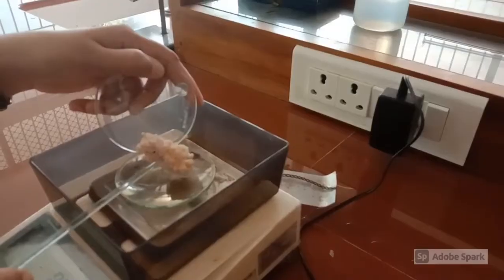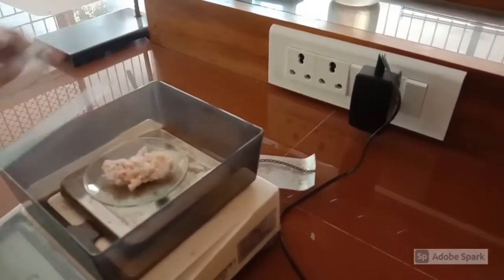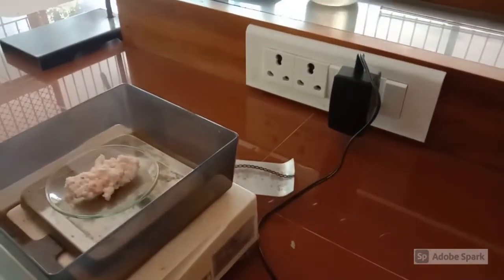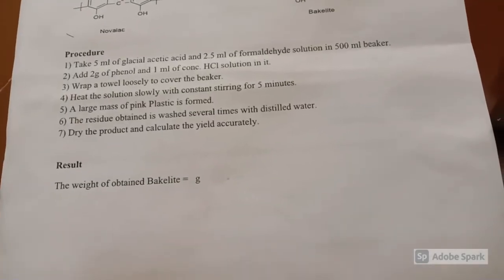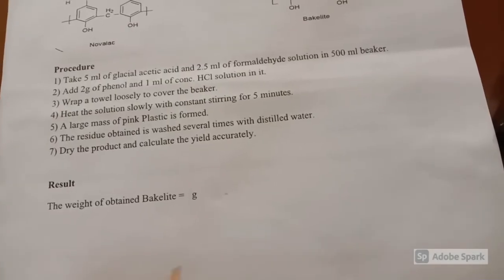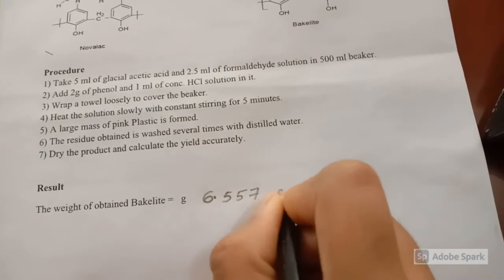Now the yield of the dried precipitate is noted. Finally, the result is reported: the weight of obtained Bakelite is 6.557 g.